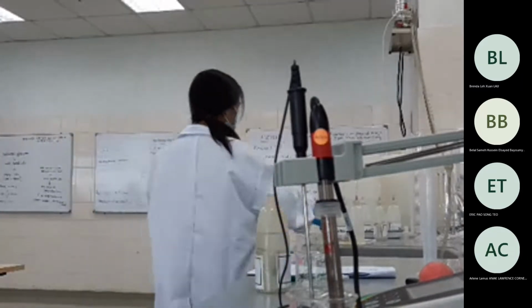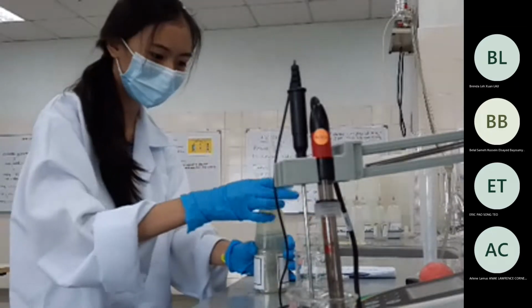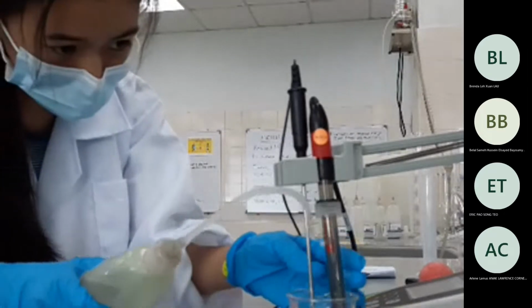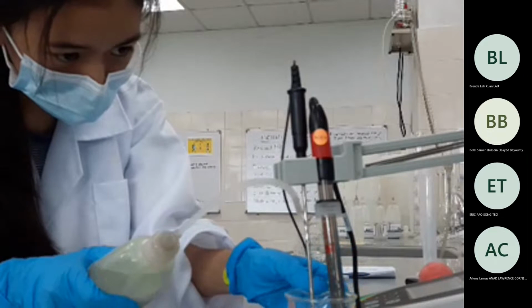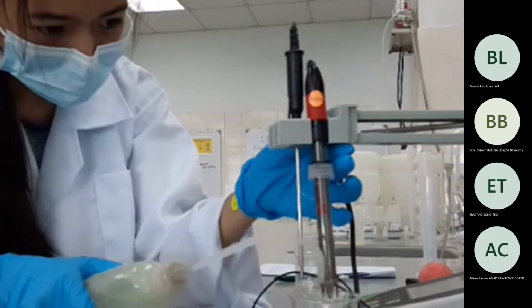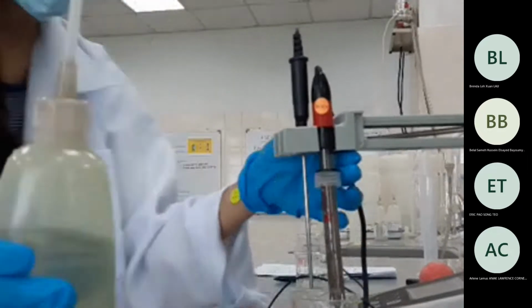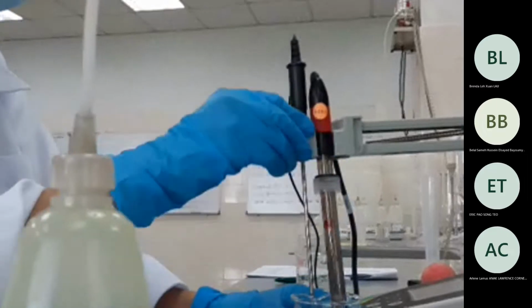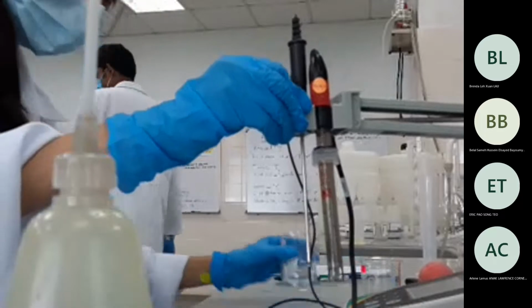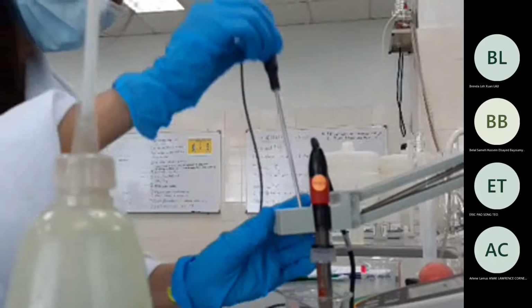Fix it, and put the probe inside there. Another 2 minutes for us to finish.